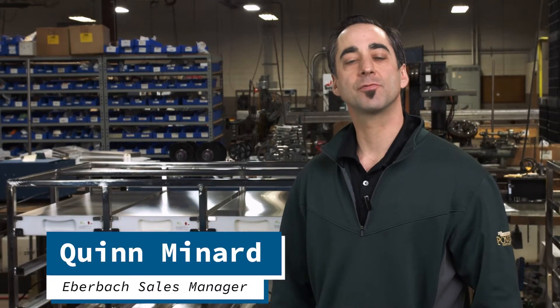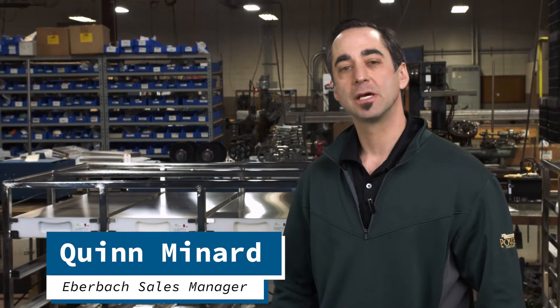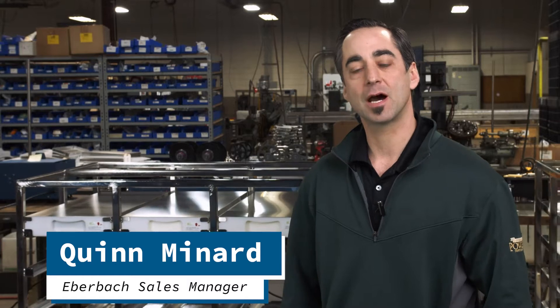Hi, I'm Quinn Menard, responsible for sales at Eberbach Corporation. I'd like to take a couple of minutes to explain our E6155 Series Orbital Shakers.